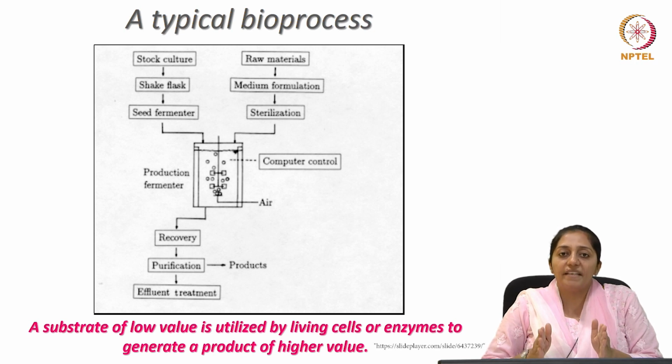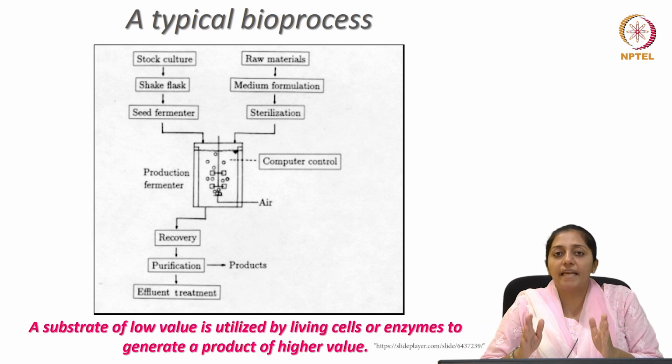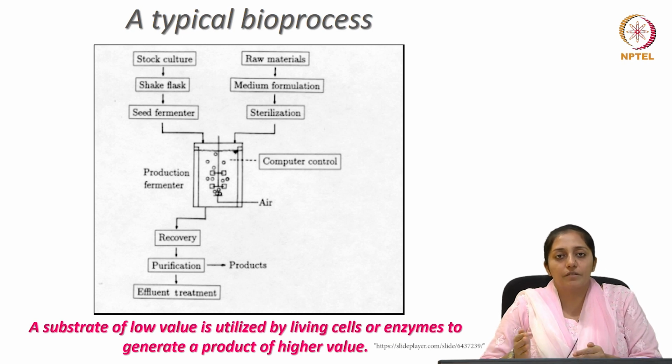So in order to maintain those required set of conditions at their optimum values, to maximize the productivity or the production rates, there is an automated control which can help in maintaining the culture conditions of this controlled system environment at its optimum. Generally, you will find there is pH, dissolved oxygen, temperature. These are the key parameters which can be controlled in a reactor.